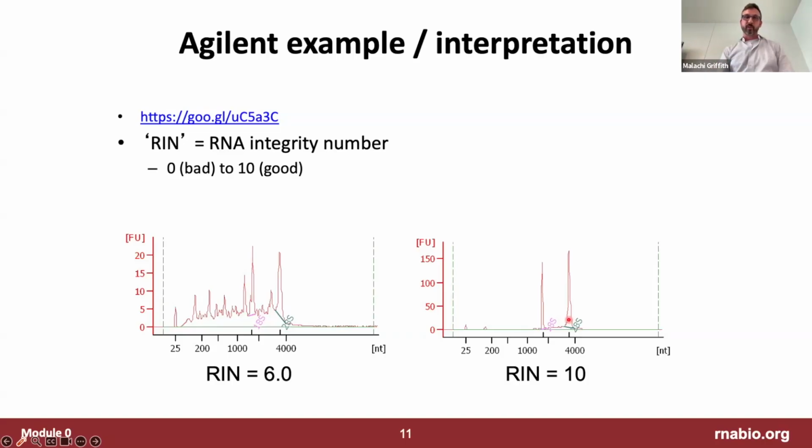And then as the RNA gets degraded, as it is in this sample on the left, which was a piece of human colon tumor that was in a freezer for several years and then thawed by me and scraped into little bits and subjected to RNA isolation, the RNA just gets broken into pieces. And so now you get what would look like a smear on a gel. It's fragmented into little pieces. And you can use the ratio of the area under the peaks of all of these little peaks relative to what it would look like if we had perfectly intact RNA to come up with a score, often called an RNA integrity score, that gives you a numerical estimate of how intact your RNA is.